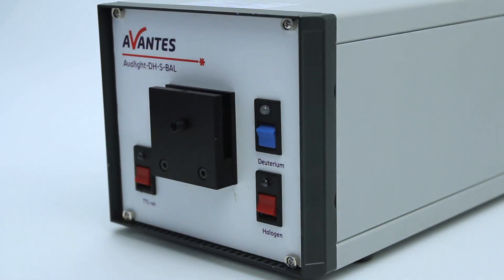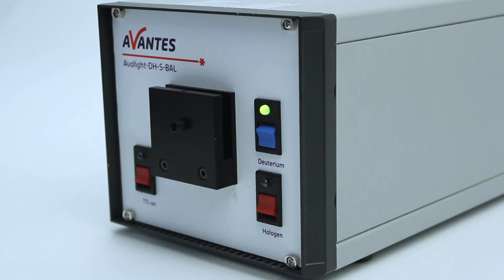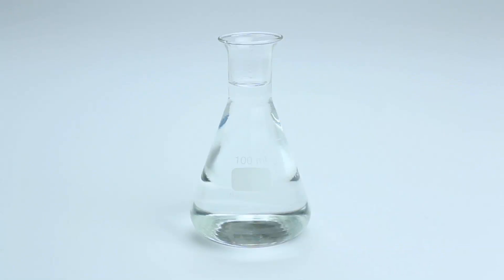Be aware that the Avantis deuterium halogen light source needs to be warmed up for 15 minutes to have a stable output of the lamp. In this example, we are measuring ethanol.